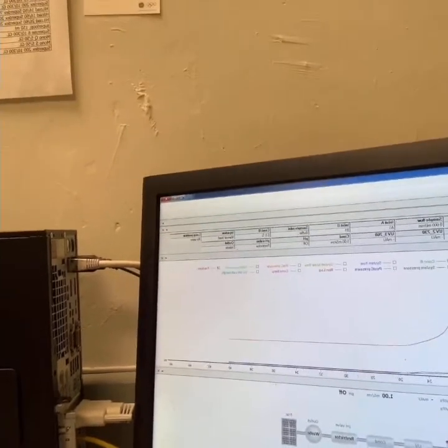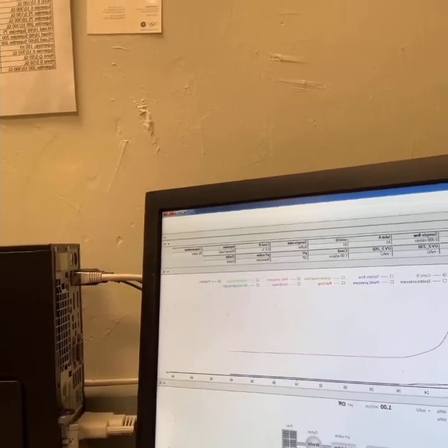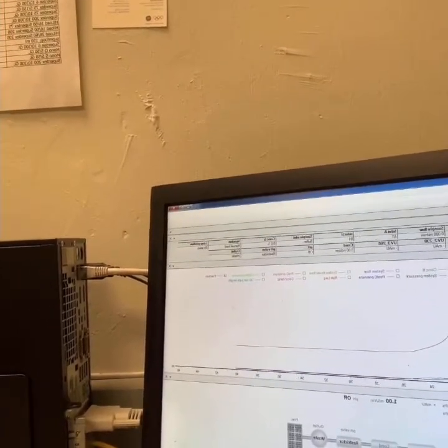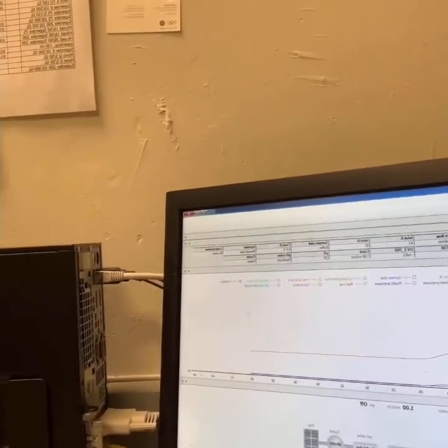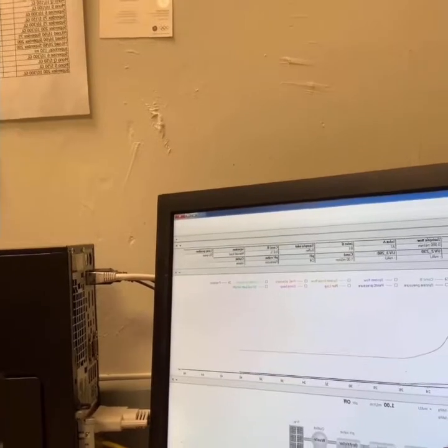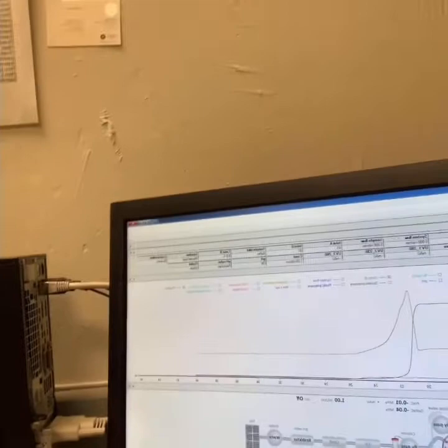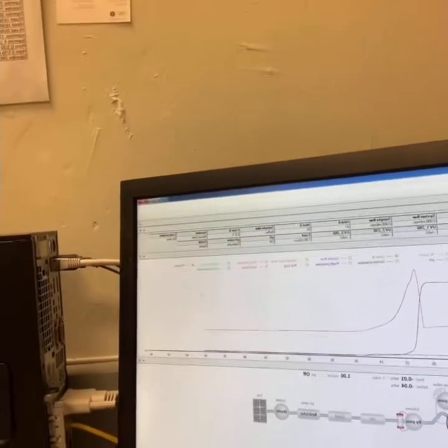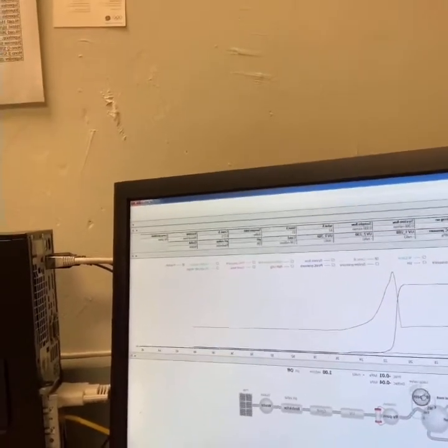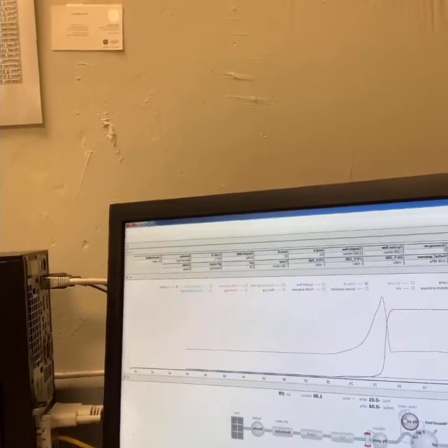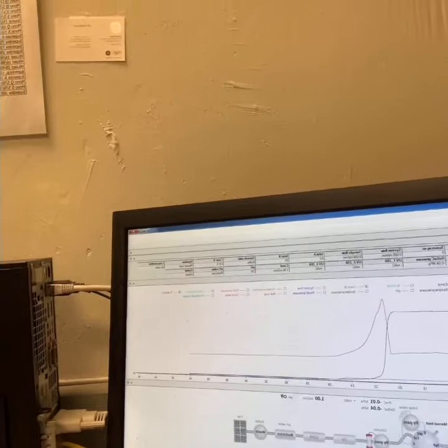And there's also this other line which goes through the sample pump. So you can have it pump up your sample or buffer to chase your sample or whatever in some of the methods. So that's going through the sample pump line and it goes into here. And here's the central hub where it's kind of like a subway with a bunch of different tracks. So you can think of the tubing as all these different tracks and there's different valves that can send it one place or another.